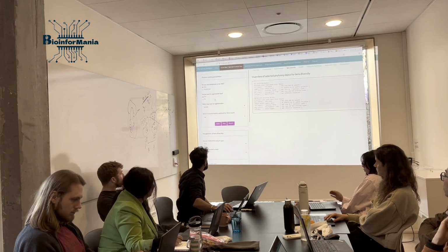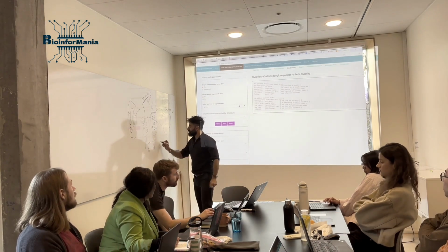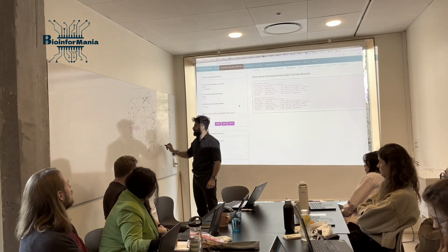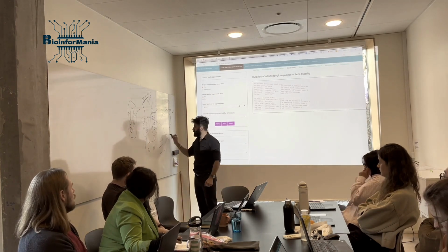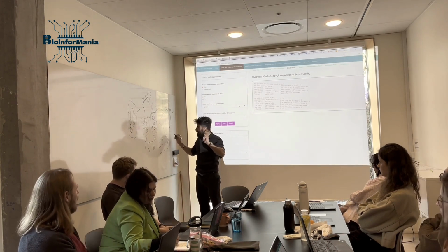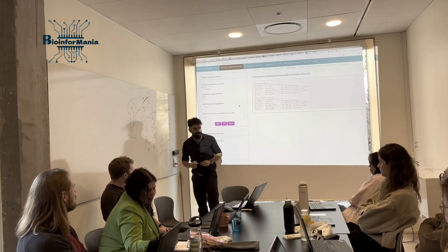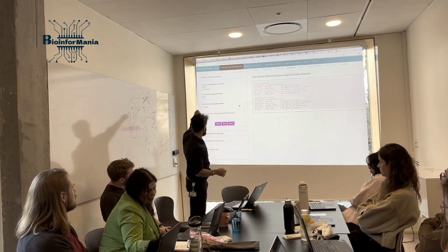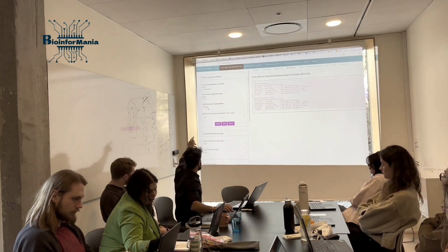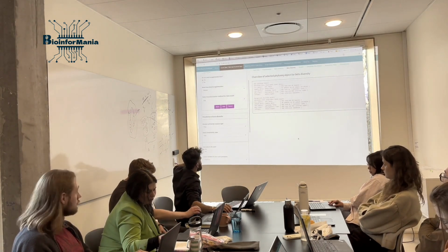Anyway, you want to agglomerate your taxa here. Because at species level, if you look at your OTU, you have a lot of, let's say, Salmonella, a lot of copies. So we agglomerate them. We say take all of them that have the same name, give them one name, but give me the number of them. So we have 3 Salmonella. That's called agglomeration. You want to agglomerate here? I said yes. Which level? Always species. And then you go down to the visualization. Sorry, I need to apply first.